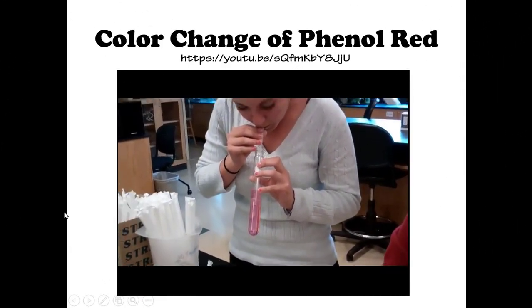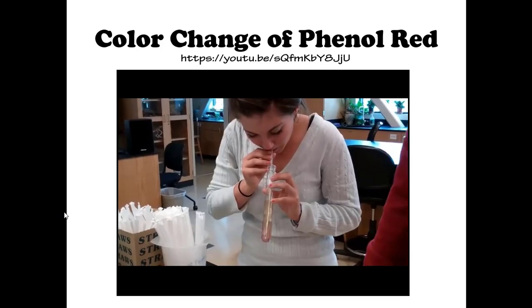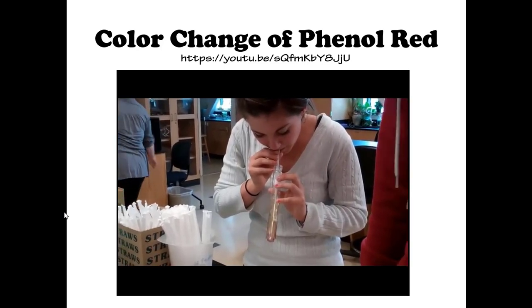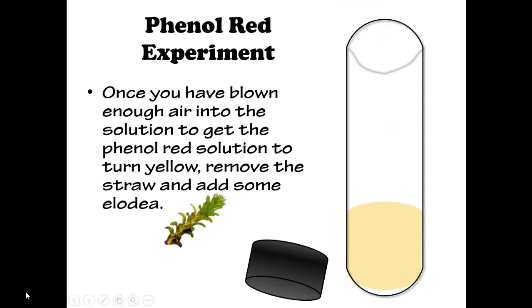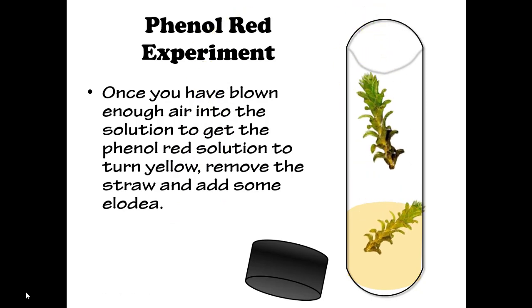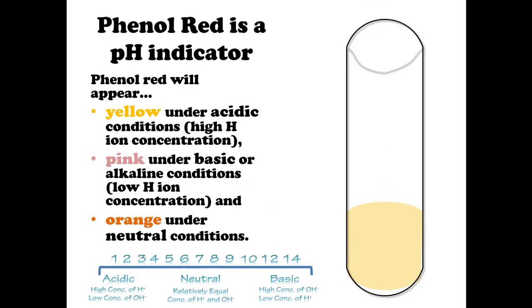Here is a demonstration of the color change of phenol red. Once you have blown enough air into the solution to get the phenol red to turn yellow, remove the straw and add some Elodea. Phenol red will appear yellow under acidic conditions, pink under basic or alkaline conditions, and orange under neutral conditions — neutral being a pH of around 7.0.